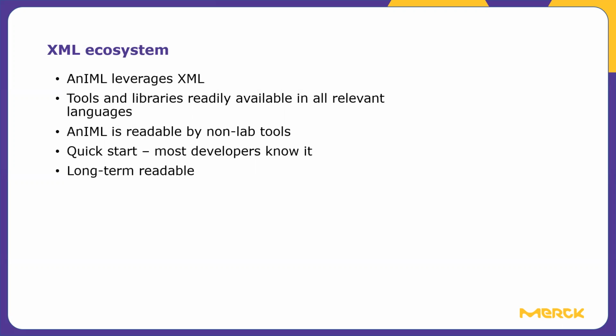And as you know, AnIML leverages XML, so it's part of that XML ecosystem. This means that tools and libraries are readily available in all relevant languages, and it's readable even by non-lab tools, which means that we don't need specific tooling written for our workflows. We can piggyback on a huge industry of the Microsofts and the IBMs and the Red Hats of the world that can directly consume data out of XML.